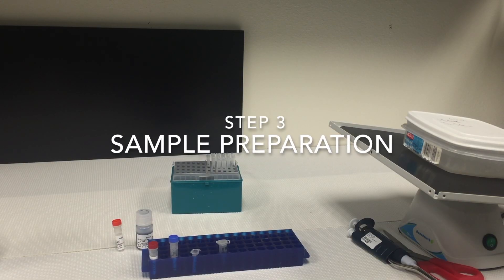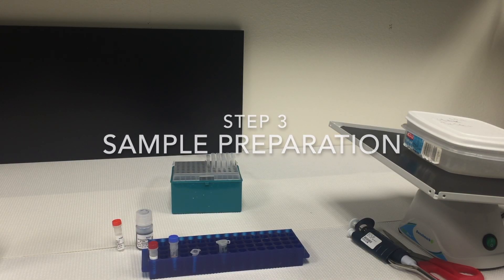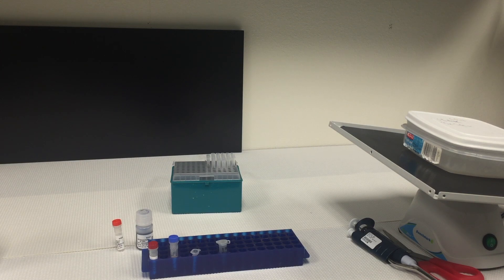Step three: sample preparation. Prepare samples using ClearPage sample buffers according to the instructions provided with the ClearPage gels.